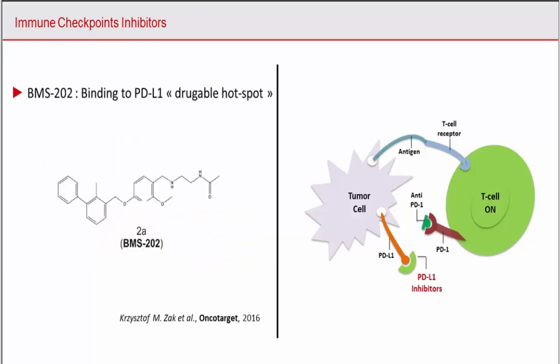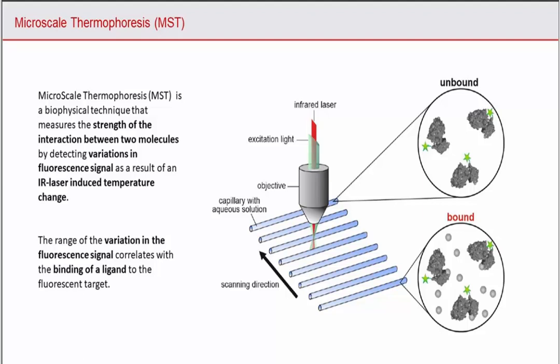There are also low molecular mass inhibitors that have been studied for their ability to modulate the PD-1 signaling pathway. These inhibitors are based on different types of molecules, such as macrocyclic peptides or oxadiazole derivatives. BMS has also recently shown that new PD-L1 inhibitors, which are under patent, can bind to PD-L1 and dissociate the PD-1 PD-L1 complex at stoichiometric concentrations. However, those compounds induce the dimerization of PD-L1 in solution. So we are using MST to evaluate those compounds.